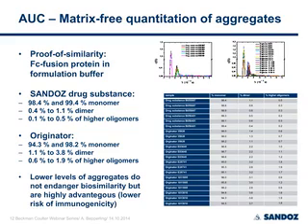Usually the LOD, LOQ is still under discussion, but you can say you can expect peaks above 0.3, 0.4% to be really true. And the precision you may expect is also in that range. So 0.3 to 0.5%, in my experience, is the precision you can obtain in a triplicate measurement.